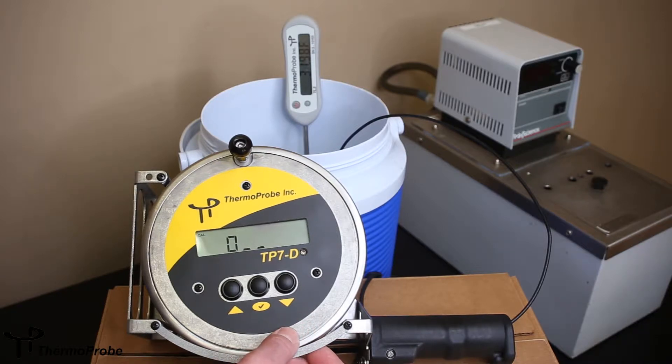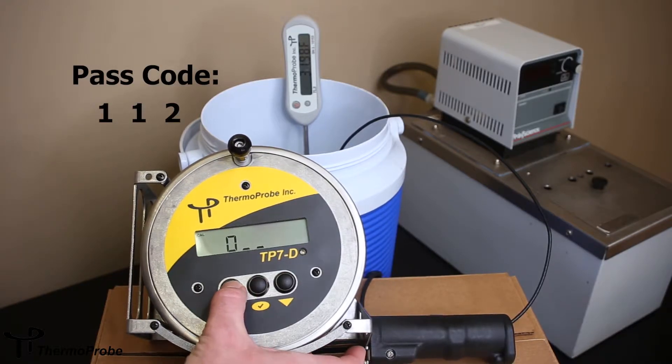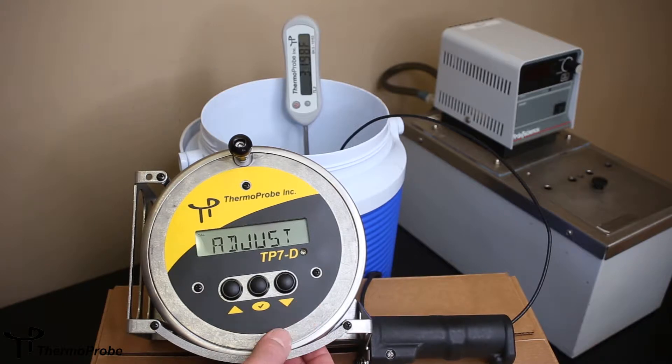To get into calibration, it requires a three-digit password to ensure it's not changed by accident. The password is 112. You use your up and down arrows to increment: one, one, two — and that gets you into calibration mode.